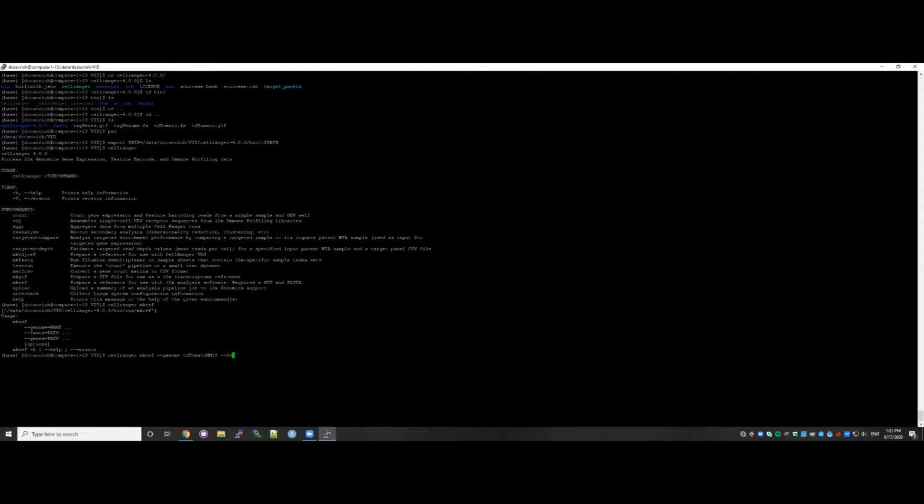Minus FASTA, and then I'm going to provide the FASTA file that we created, tag genome FASTA, and then I'm going to add minus genes, and that will be tag genes.gtf.